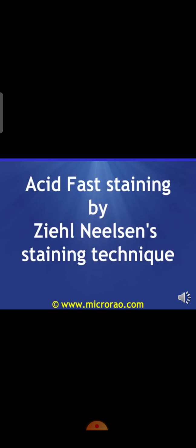When we start the Ziehl-Neelsen staining technique, we apply the first stain, which is the concentrated carbol fuchsin, and we flood the surface of the slide with this stain.